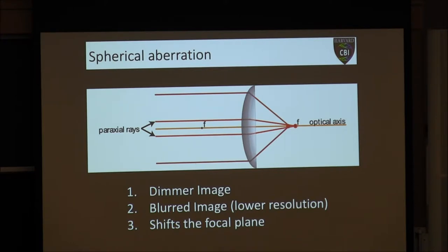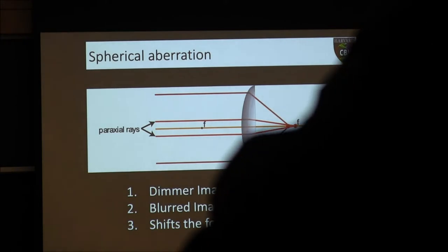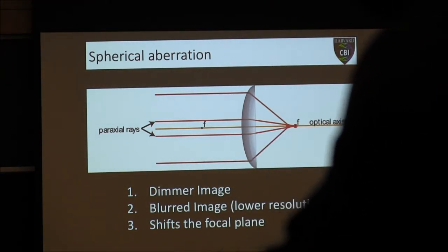I want to talk about five big problems spherical aberration produces in the microscope — starting with three. These are things you've probably heard about, and they apply not just to microscopy but photography and astronomy as well. Because all these rays aren't getting focused to the same point, we get a dimmer image — not all the light reaches the detector. Things get blurred because they're not coming to a sharp focal point. And the third effect is that it actually shifts the focal plane.